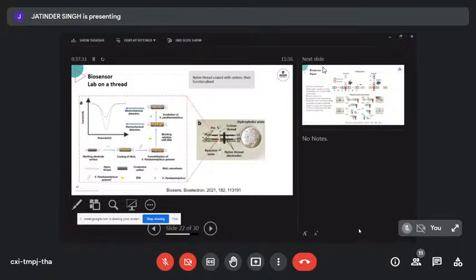But in addition to microfluidics and lab on a chip, there are also people that have lab on a thread, where they take a cotton thread like this, which our clothes are made of. There are small microcontainers as well. You can wet them with electrolytes and move things along. What they've done here is start off with a nylon thread. They put a hollow conductive carbon electrode over it, then coated that with molybdenum sulfide, and put an aptamer on there. An aptamer is a bit of DNA that thinks it's an antibody. It's a bit of DNA that's folded in a geometry so that it becomes a recognition element.